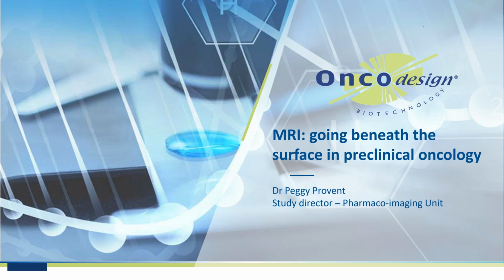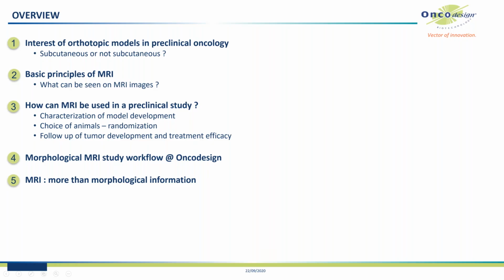Thank you. So the aim of this presentation today is to give you some information on how you can use MRI in your preclinical studies and how we handle the MRI workflow at Oncodesign to improve our orthotopic follow-up.